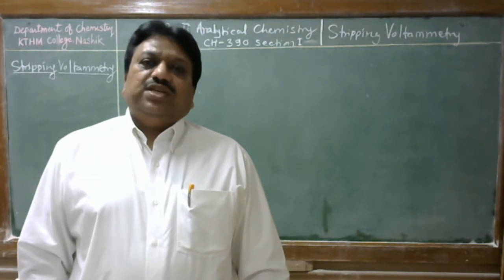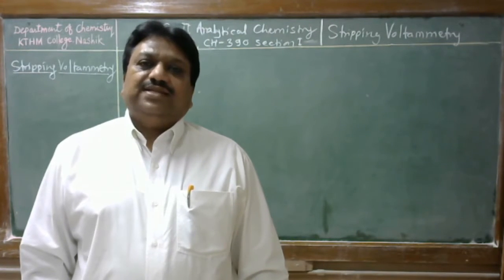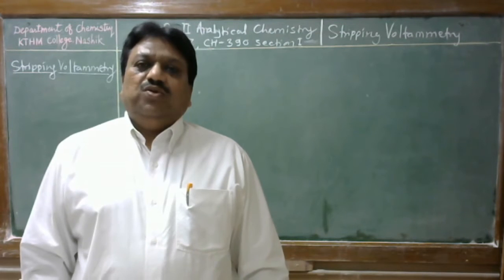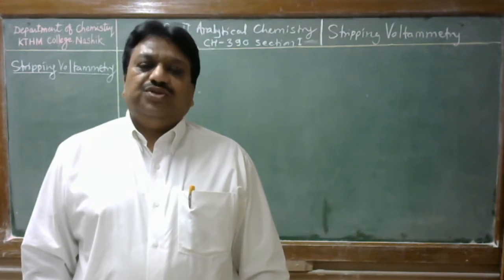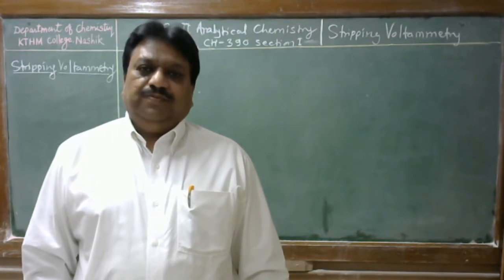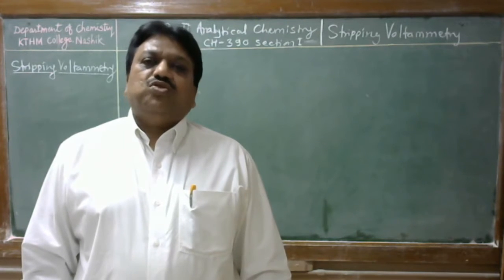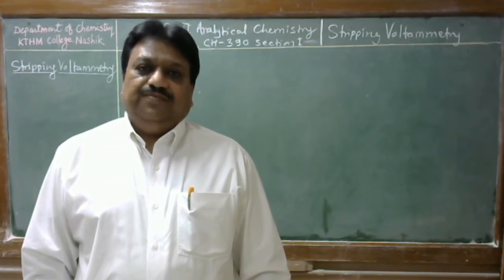In addition to this, we discussed the derivative technique of polarography, that is hydrodynamic voltammetry, which is performed in an analyte solution which is continuously in motion by using a stationary working electrode. We also know that hydrodynamic voltammetry is superior to polarography.